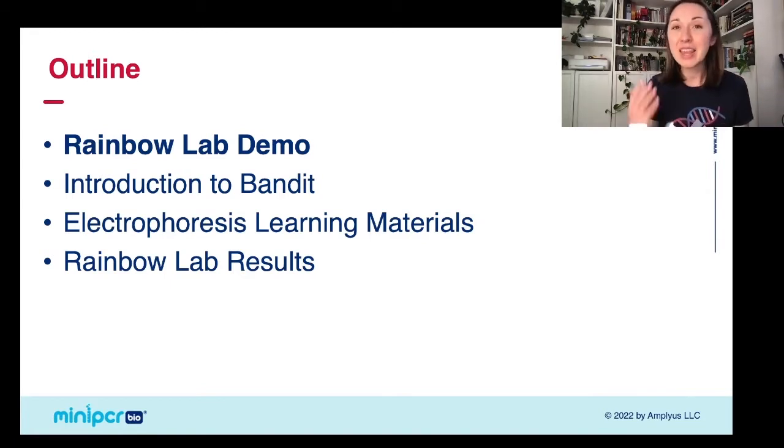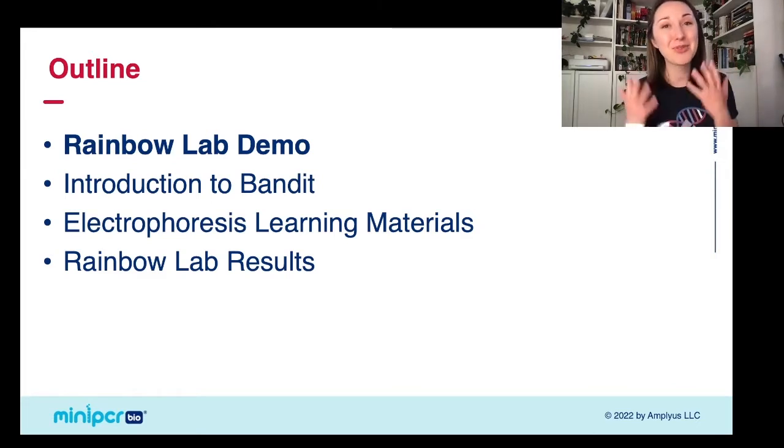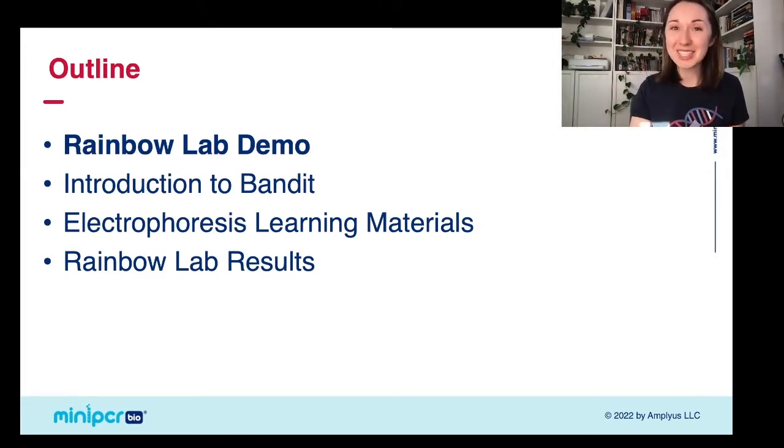Then we're going to go through some curriculum materials, so things that you can use in your classroom to help introduce your students to electrophoresis. And then finally, in real time, we're going to go through the results of our Rainbow Lab. So I'm really excited to walk through this.